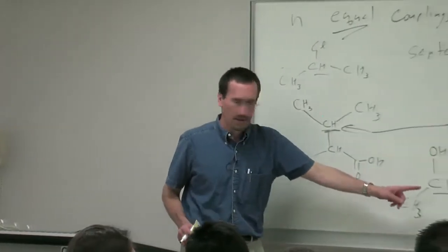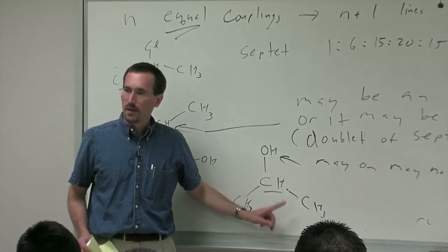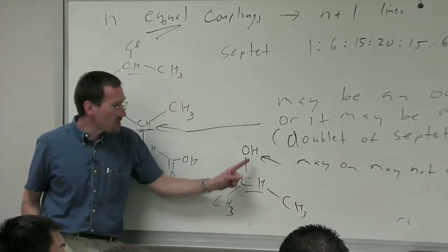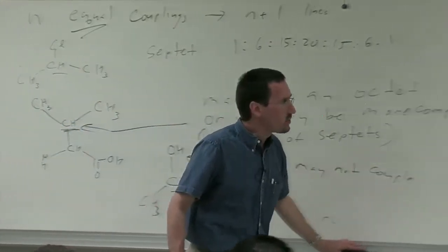not couple. If that does not couple, can you also assume that the proton on the alcohol will not couple as well? You mean, yes, it's like if one doesn't couple, the other one won't. Absolutely. Coupling is mutual. Okay.